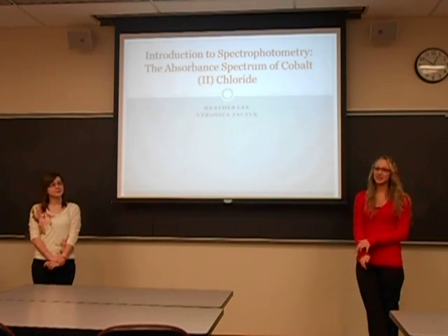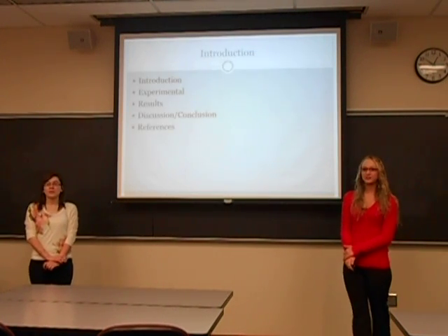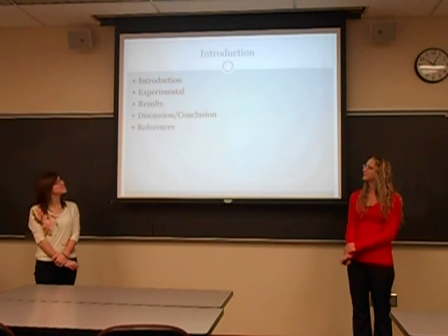We are doing the introduction to spectrophotometry, the absorbance spectrum of cobalt chloride. The overview is basically the introduction, the experimental, results, discussion and conclusion, and also the references.